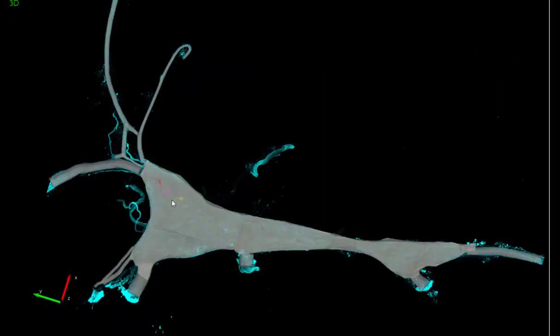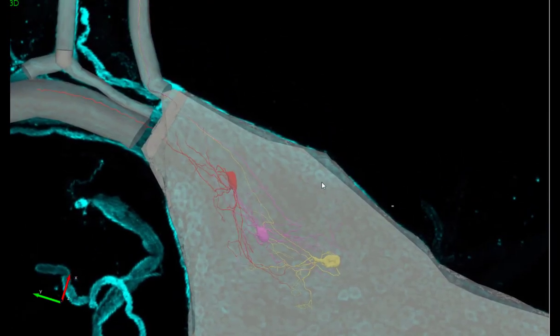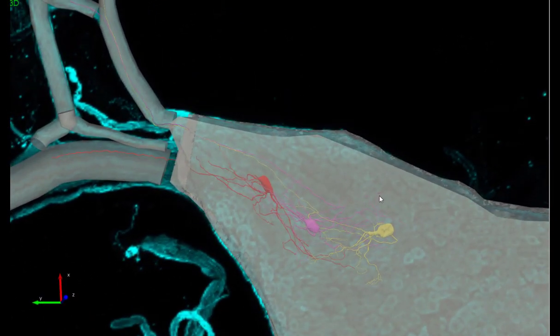Additional structures, such as the cardiac nerve, were segmented to provide fiducial landmarks. You can visualize the axons of the yellow and pink cells innervating the cardiac nerve.